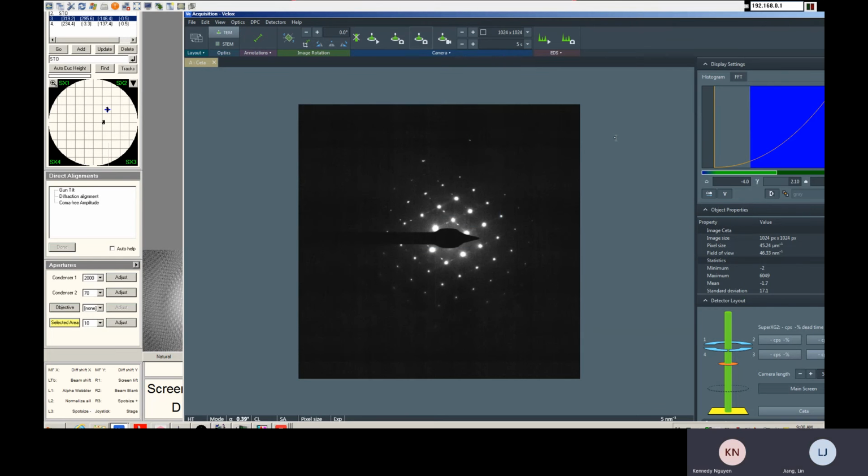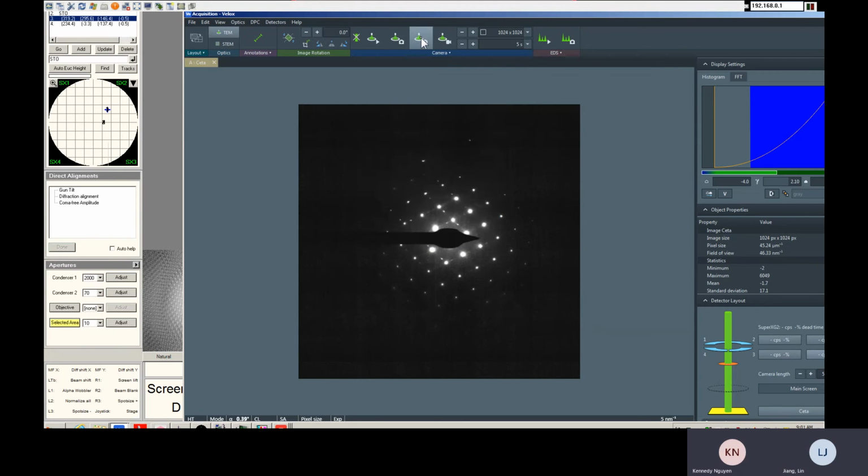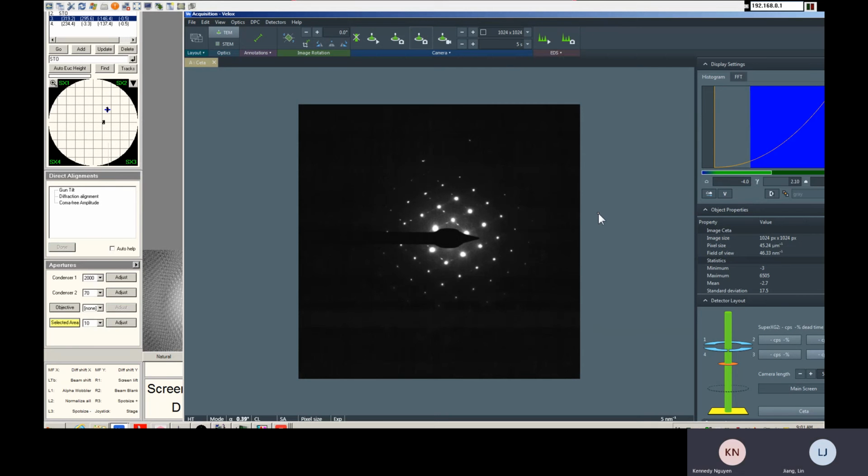Yeah, it's going to take a longer time, but it's fine. Okay, it's a lot more solid, less noisy. Okay, we'll switch over to processing.